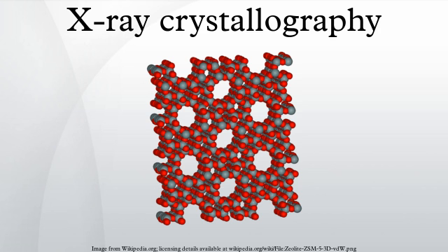Ewald's sphere. Each X-ray diffraction image represents only a slice, a spherical slice of reciprocal space, as may be seen by the Ewald sphere construction. Both k_out and k_in have the same length, due to the elastic scattering, since the wavelength has not changed. Therefore, they may be represented as two radial vectors in a sphere in reciprocal space, which shows the values of q that are sampled in a given diffraction image.